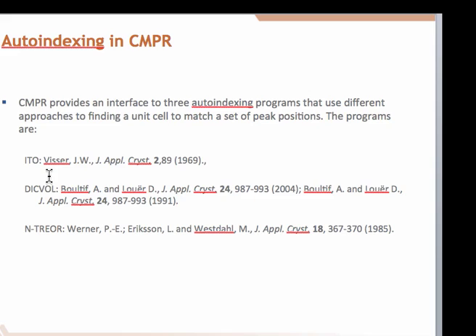The programs available are ITO, which was written by Jan Visser quite a while ago. It's still one of these trusted and true programs that are quite useful. The DICVOL program was written by Ali, I'm not sure how to pronounce this, Bultif, and Daniel Louer, and they have continued to improve it.